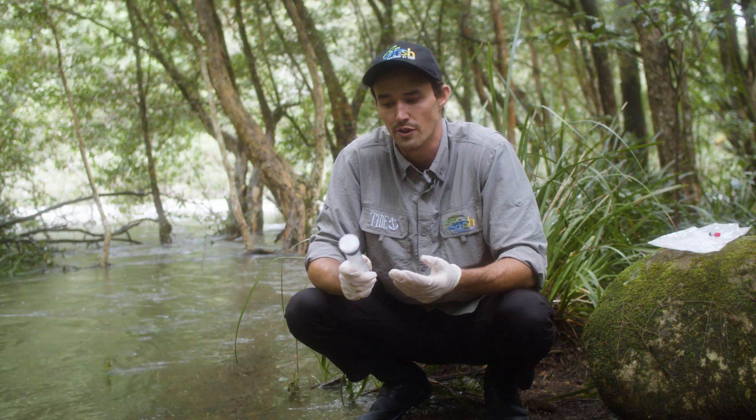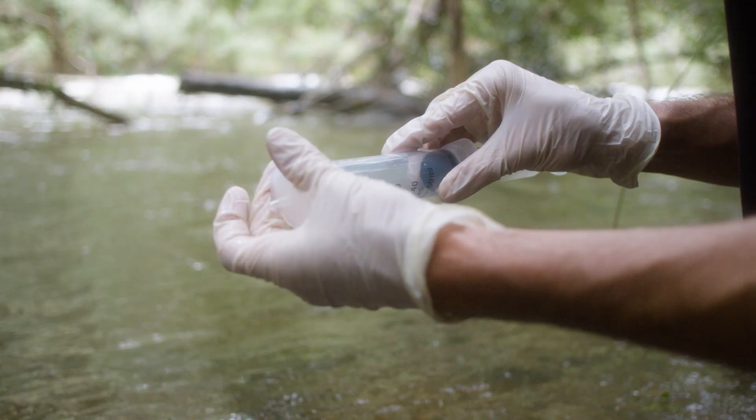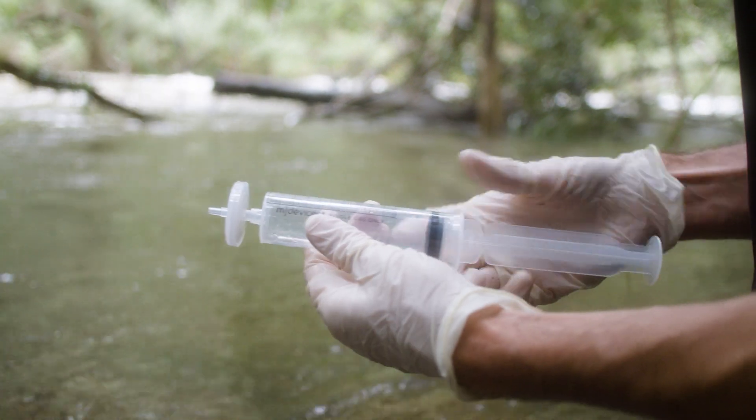Once you've recorded how much water you've filtered, all we need to do is purge the filter to remove any excess water. To do this, just fill it up with air and force that air through.